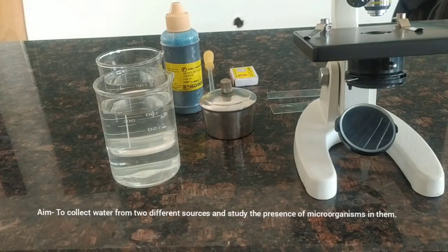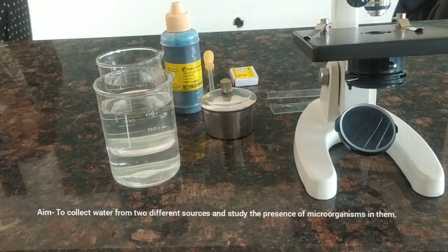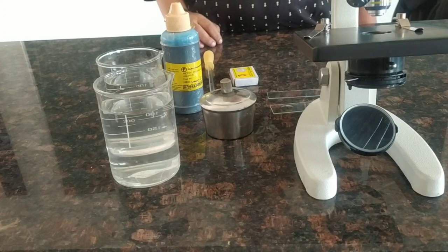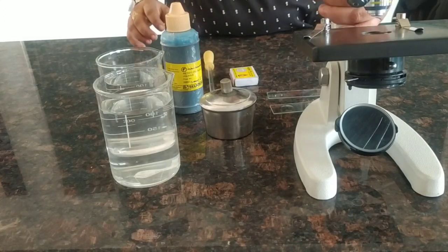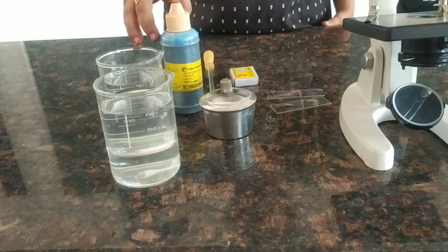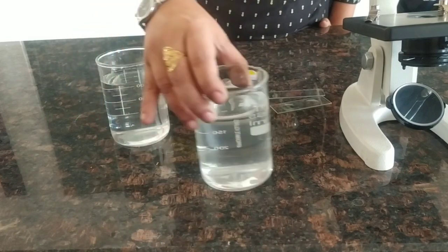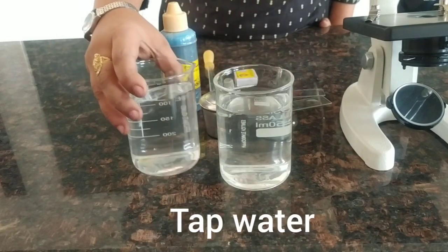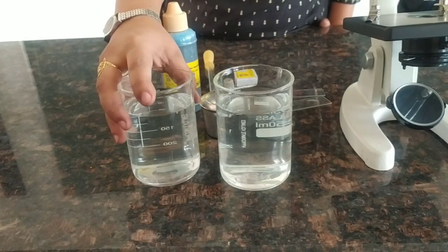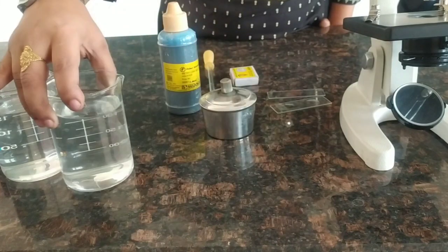Aim: to collect water from two different sources and study the presence of microorganisms in them. Materials required: microscope, tap water, pond water. You can take any other source of water also for this particular experiment.